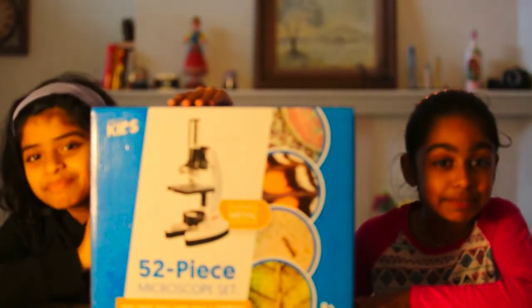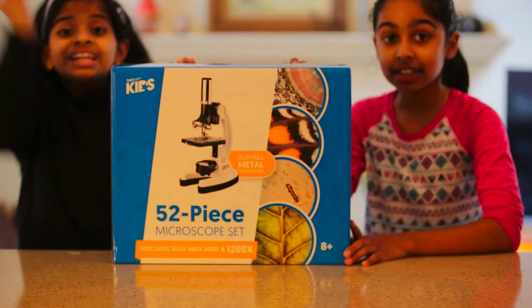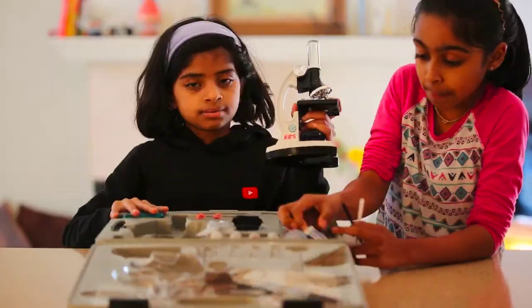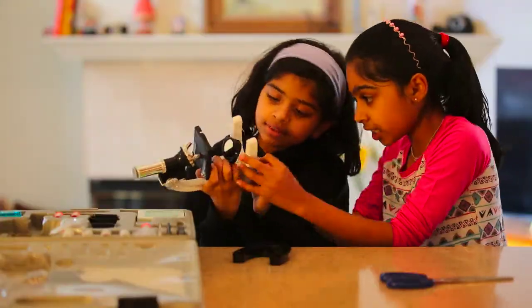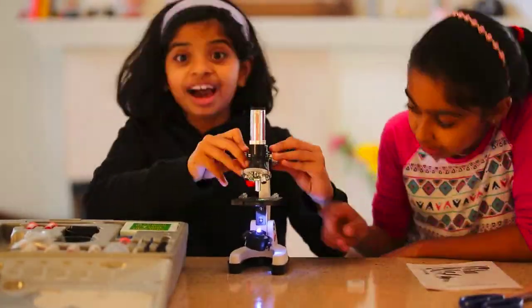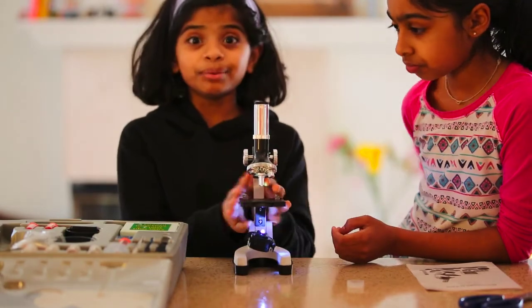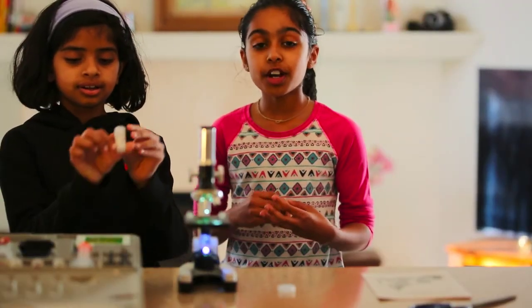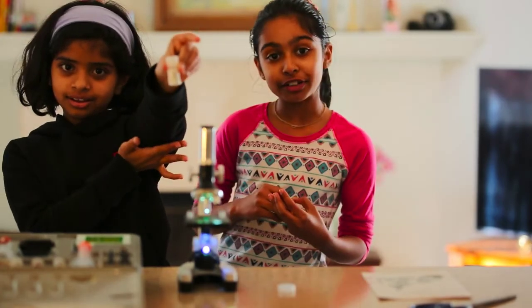Sure. A 50-piece microscope set. So let's begin. Now we need something to put this in. Let's put it over here. To test the microscope, we're going to look at some seaweed up close.